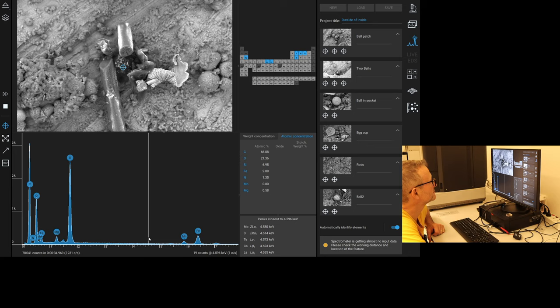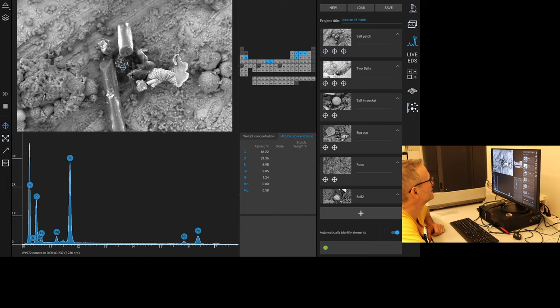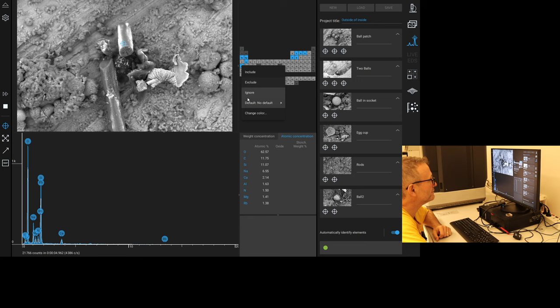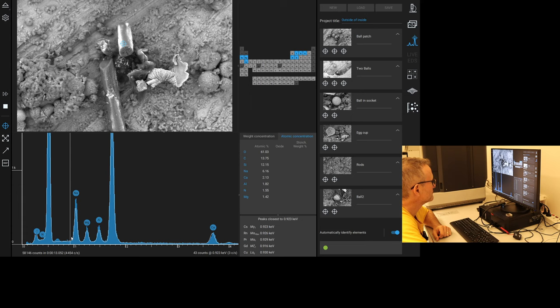That is where the sample was cut. That's a bit of the stainless steel cut. Interestingly, we might be able to see the substructure from the end of this. Have a look at that. I guess this is the silicon stuff. I'll just make sure, but I'm pretty sure that's what it is. No rubidium. Definitely a pattern here of this stuff.